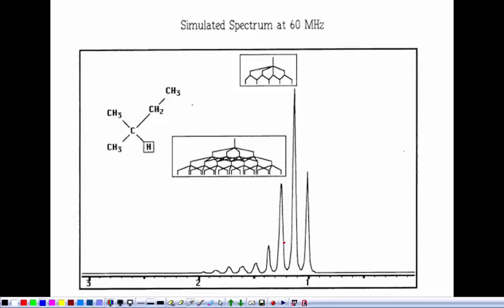They can't do anything productive with this, but they can try and figure out the structures if the peaks are at least separated and they show their normal coupling patterns. Okay? And so that's why we spend all the money on having big magnets, is to overcome this non-first order issue. So that's a limitation to coupling.